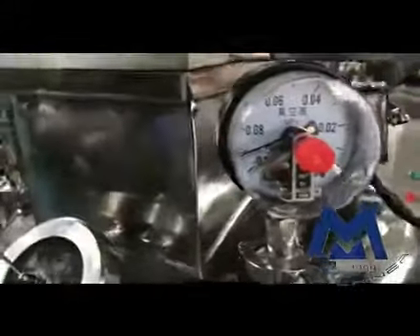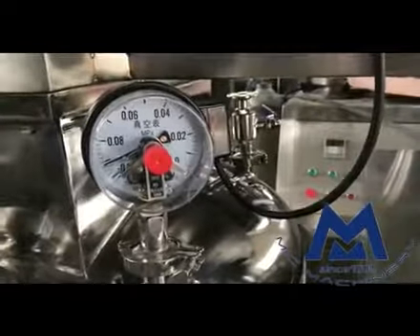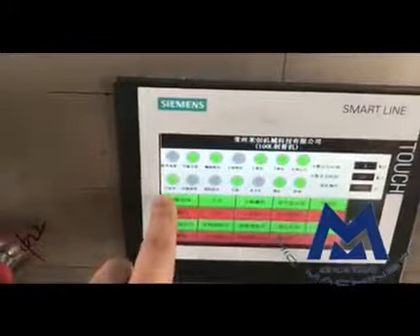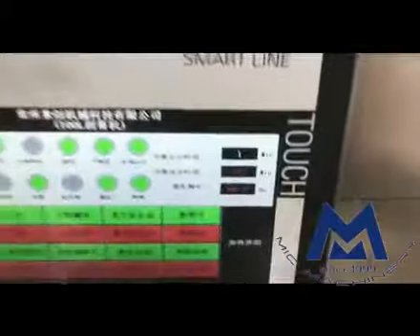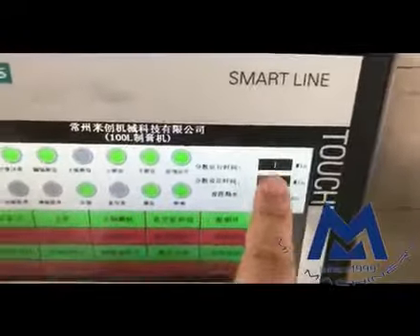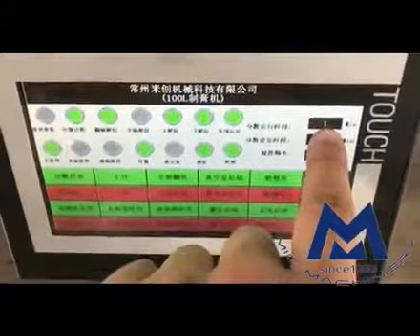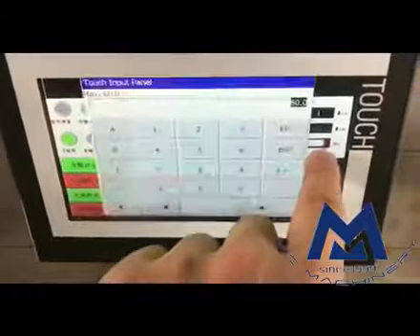Okay, so before we close the vacuum, we're going to close this valve. Okay, and then we close the vacuum. Okay, and then start mixing. Here we will have the English version in a few minutes when you arrive, and you can start, like 5 minutes. And this is the real, this is the setting, and this is the frequency.